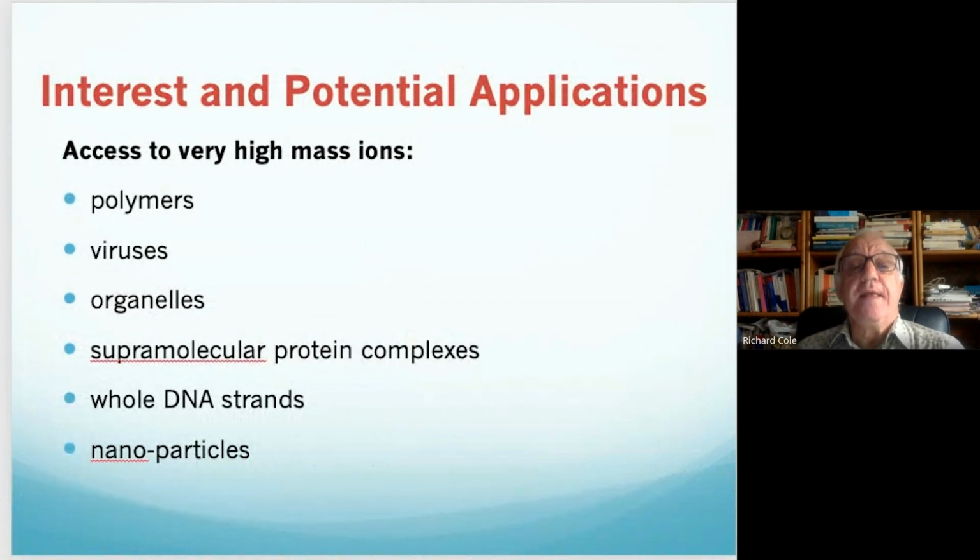Okay, so what makes charge detectors interesting are some of the potential applications. As I mentioned, we have access to very high mass ions, including polymers. So that's why I'm here today.